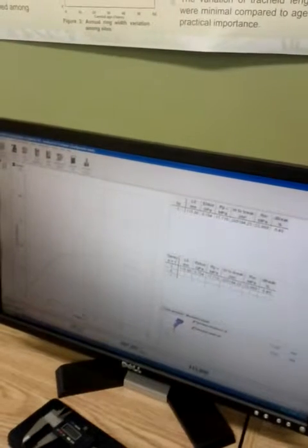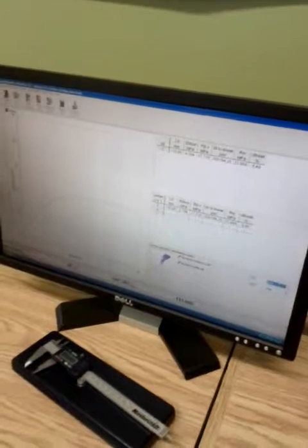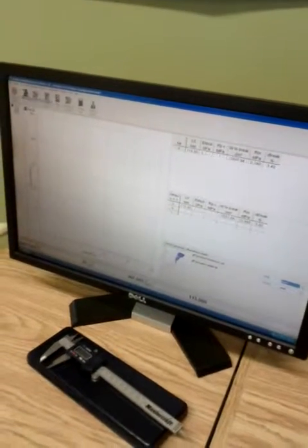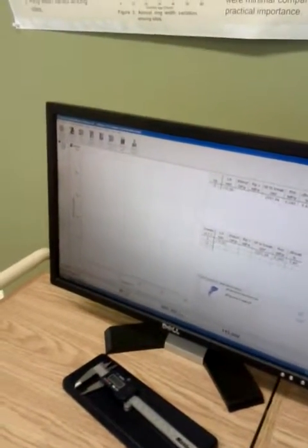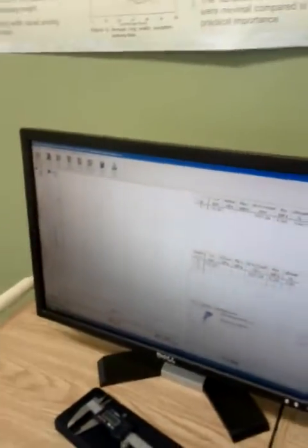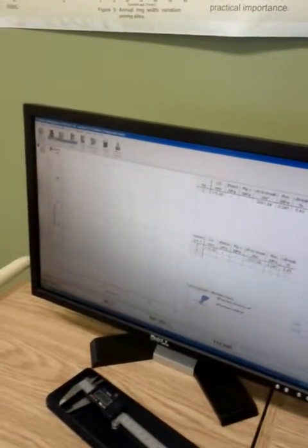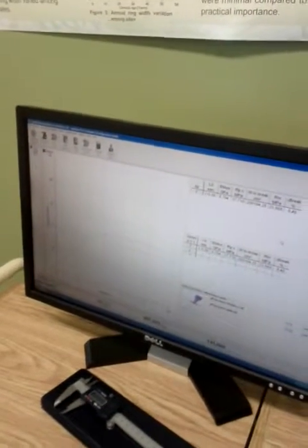If for any reason I change the value here, the thickness, and I just miss the comma, it will do something like this. You know, I have values that are very, very big. I can put it back, yes, but it does not apply. I have to ask to evaluate again, and then it's good.